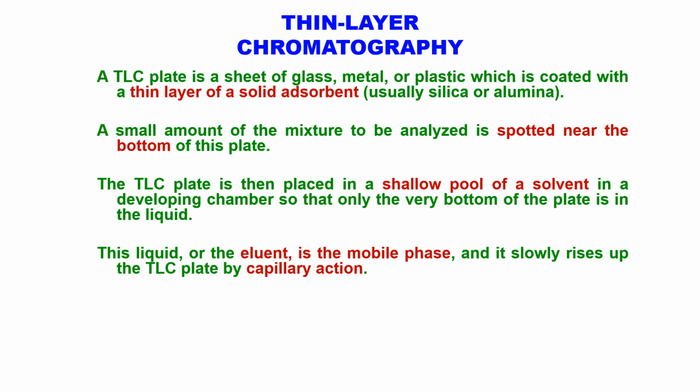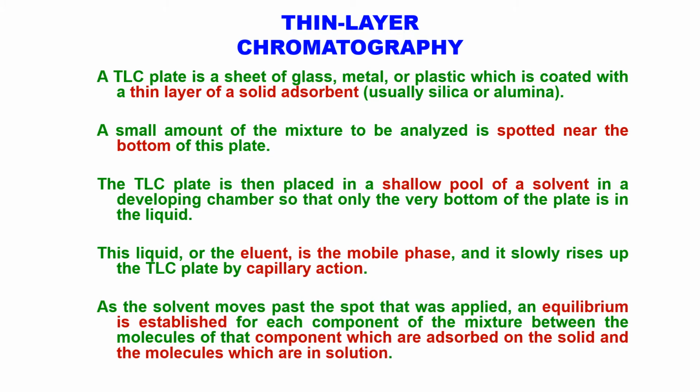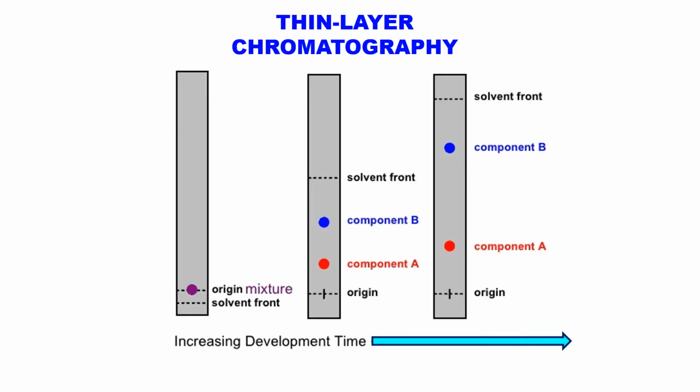So it is based upon the differences in when a particular component out of the mixture is adsorbed and at what stage it remains in the solution. So this figure should help you understand whatever I just mumbled.